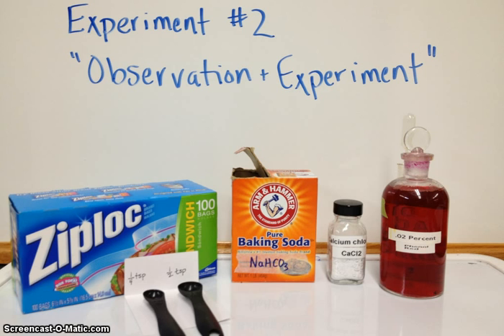Observations include temperature changes, color changes, and changes in state. How can we learn more about the individual interactions responsible for each observation? Imagine that each substance in the mixture represents a variable. By changing only one variable at a time, it should be possible to determine the contribution of each substance to the changes observed for the overall reaction.